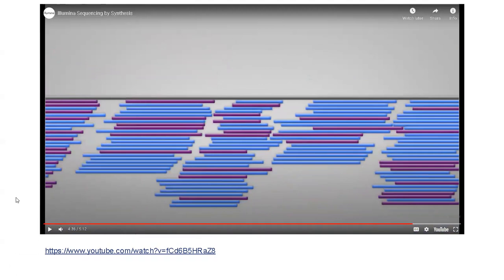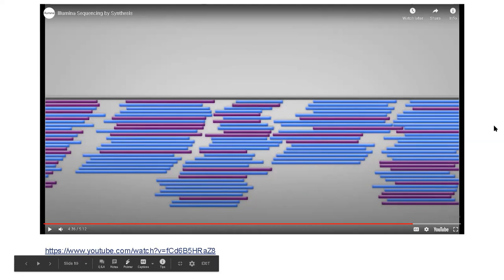Yeah, so this part is the last part, which is the analysis. A couple of things to note over here. The first is, when they were talking about these clusters, each cluster would be equal to one read. Within a cluster, there will be a number of reads, that is, you're amplifying these reads. So one cluster represents one read. So in a file later on, we will see these reads were part of one cluster, and so on and so forth. So that was the basic thing. A cluster would equate to one read, and then you amplify that particular read, and you get more copies of that molecule. So any doubts so far?